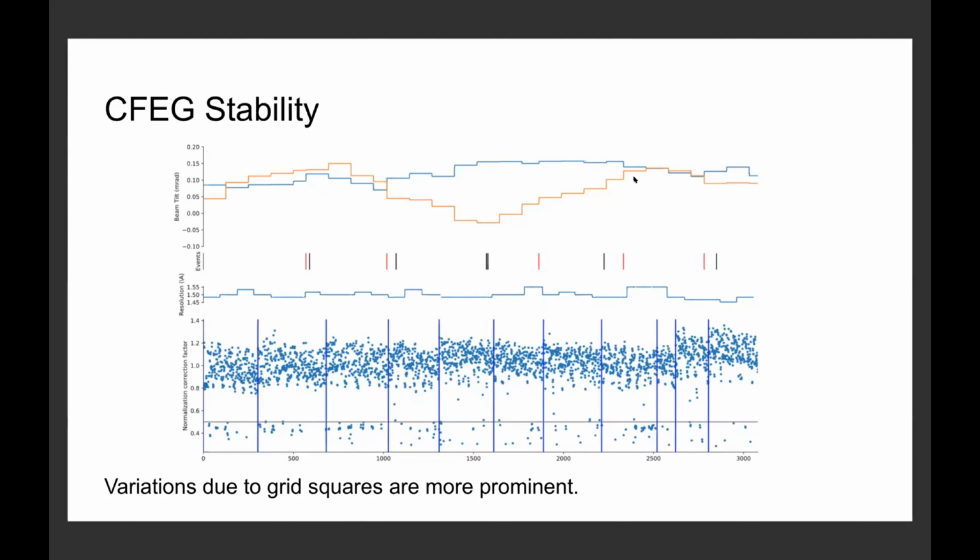But in practice, what I would suggest is to do this kind of analysis, and as long as this is fitting the time-dependent change nicely, I think that's okay. Because error in beam tilt, or very tiny error, say 0.1 milliradians, doesn't really matter unless you are going to 1.1 or 1.2 and so on. So in practice, you just try grouping every, say, 2,000, 3,000 particles, and then make a plot and see if it is nicely following the trend. I think that's enough.